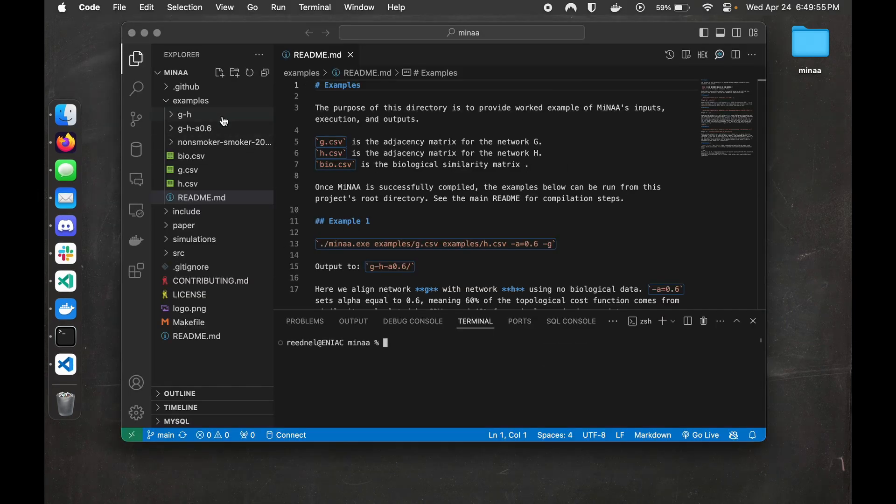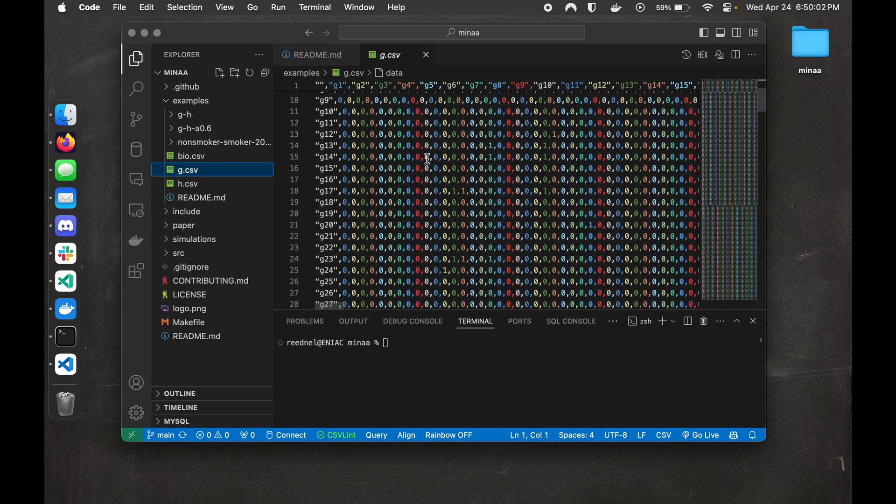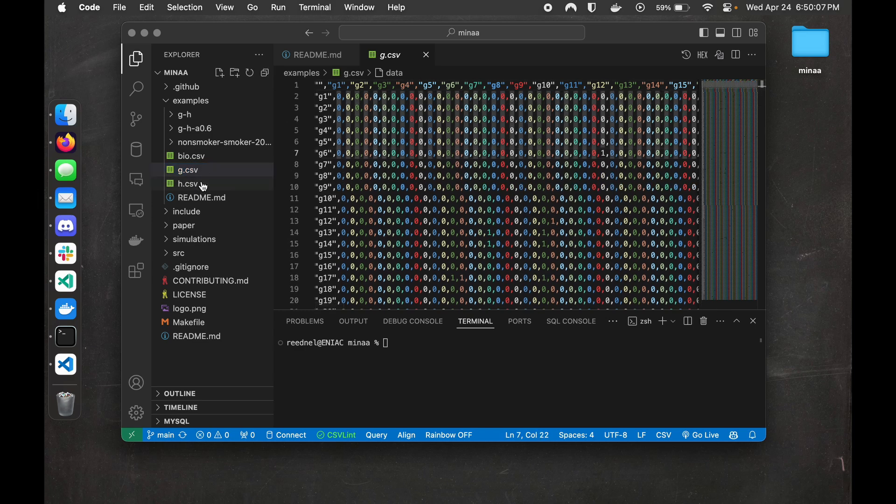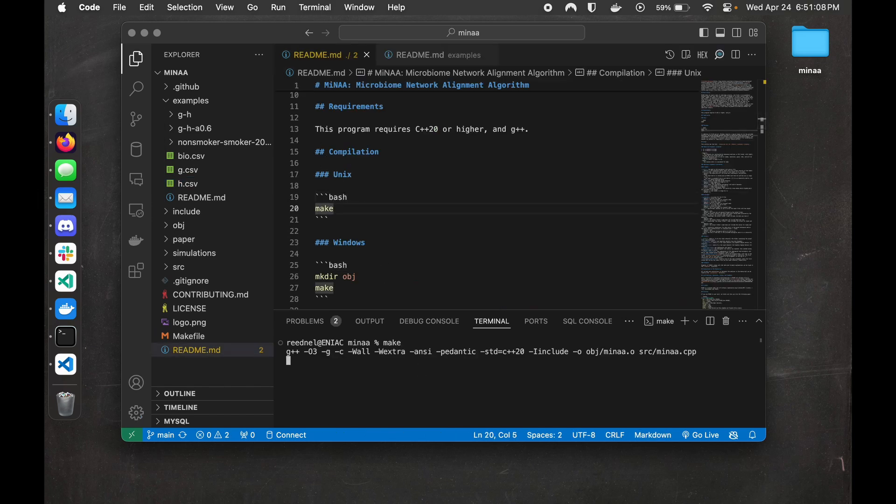Just taking a quick look at G and H, these will be our example inputs. As you can see, these are adjacency matrices, just like the red and blue ones from before. So now, assuming we've got the requisite software, we can just run make, and that'll compile MENA into an executable for us.